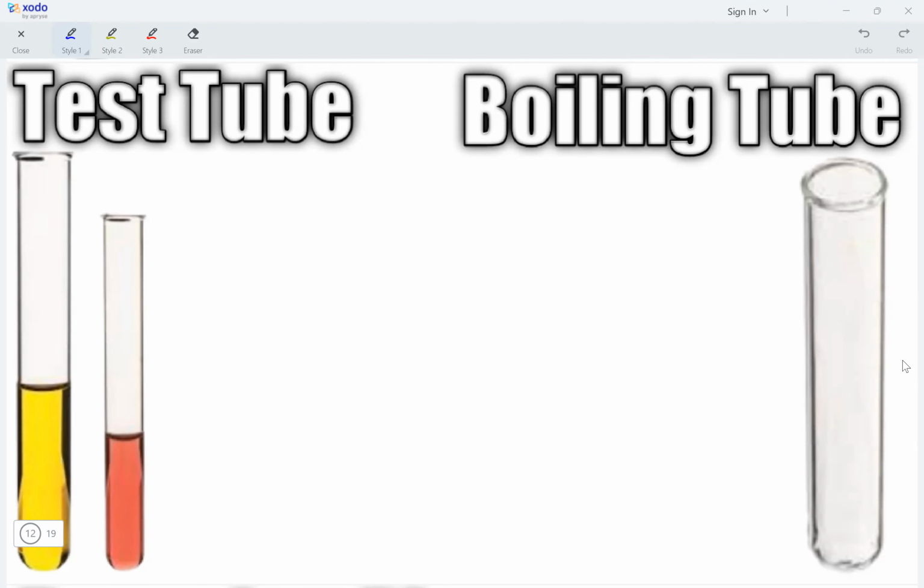They are normally used for experiments in which a salt analysis is being performed to identify the cation or anion present, in order to carry out certain reactions which produce gases, so as to identify the gas given off. They are also used in organic chemistry experiments in which oxidation and reduction take place, and that can be visualized using an indicator or a substance that changes its color.